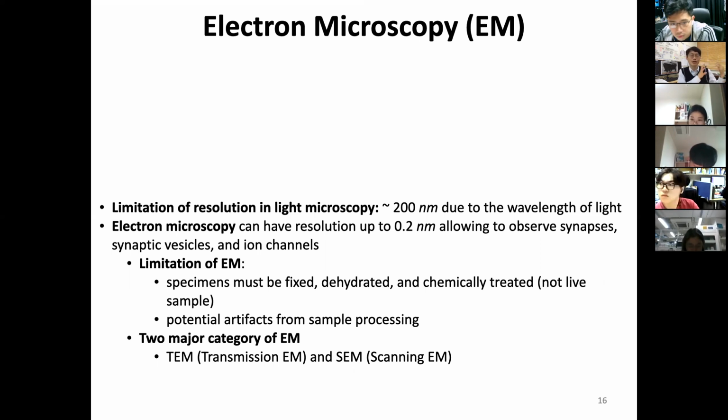This is a subject for a completely other course, but what I can say to you is that when photons interact with the tissue, they scatter. Because of this scattering, we can form an image, but also out of focus scattering makes the imaging blurry. Because of that, we cannot see very deep. But a very up-to-date study actually tried to overcome this limitation, which is also a fascinating subject. That's what I can tell you right now.